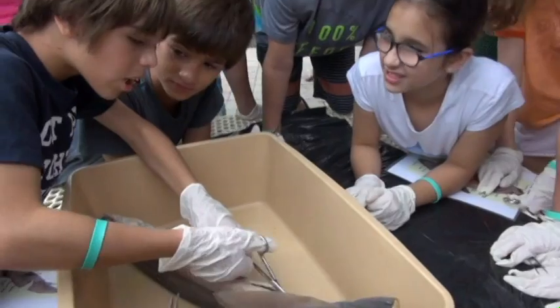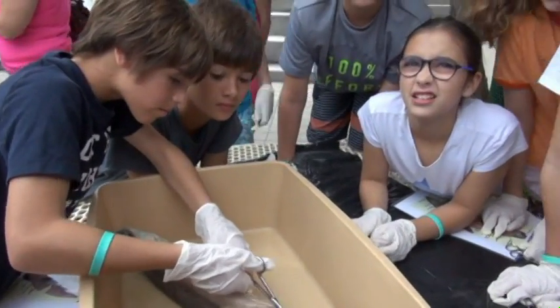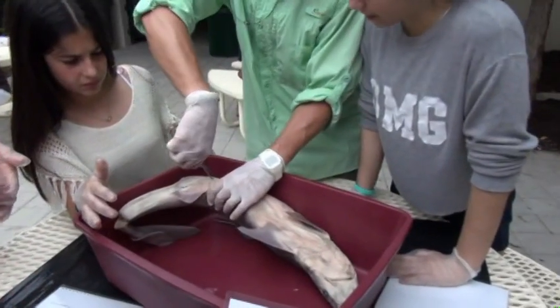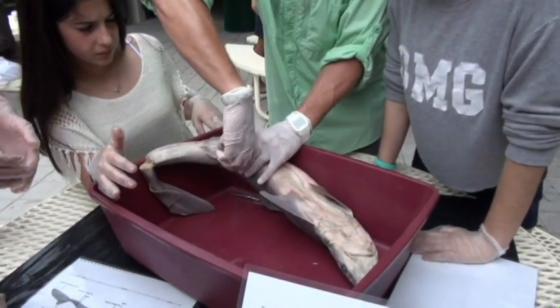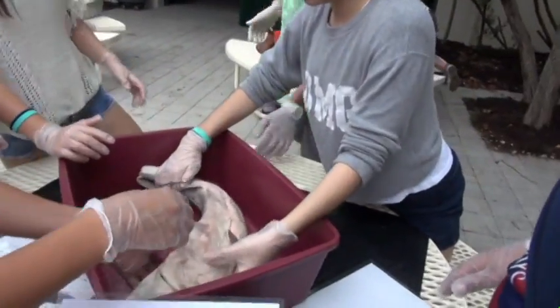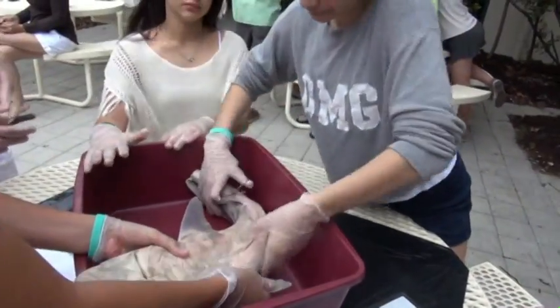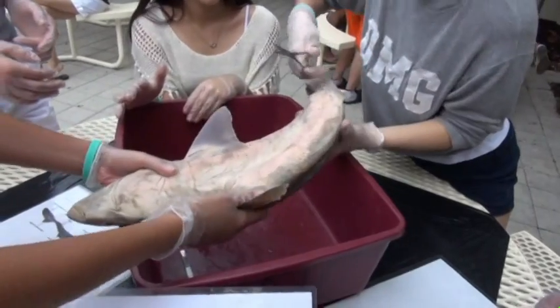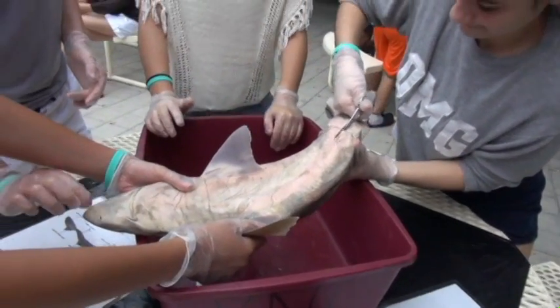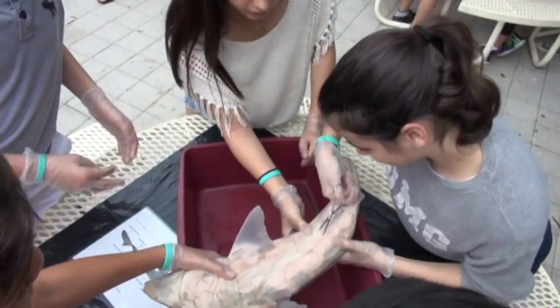Are you going to get a boy or girl shark? Boy. Boy, cool. Now where do we cut it through? Let's have a boy or girl shark here. A girl. Keep it lifted up a little bit, guys, just so you don't go too deep with it, all right? You might find some babies in there, because it's really big. That would be cool. All the others are males, I think.